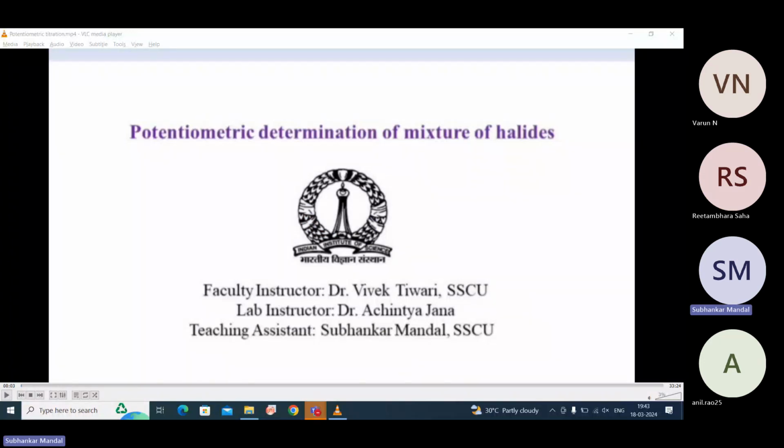Okay, so this is the video on potentiometric determination of a mixture of halides. I think these things we have already discussed. This video we made in Bangalore.